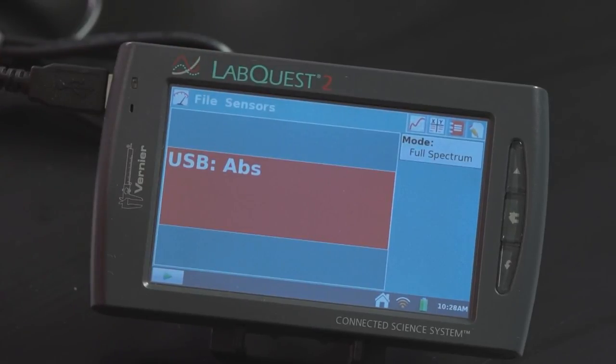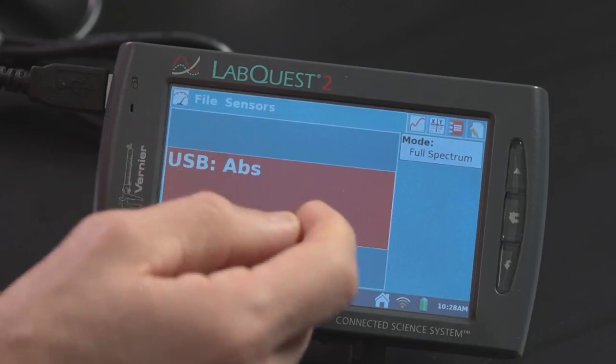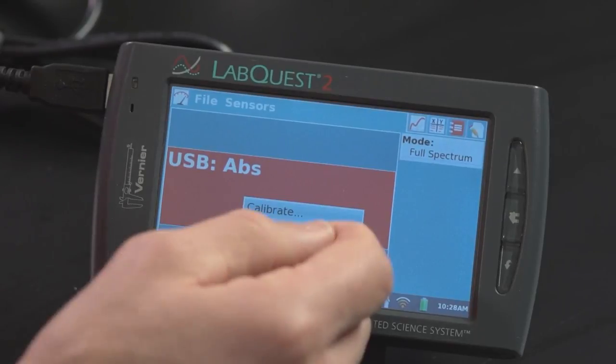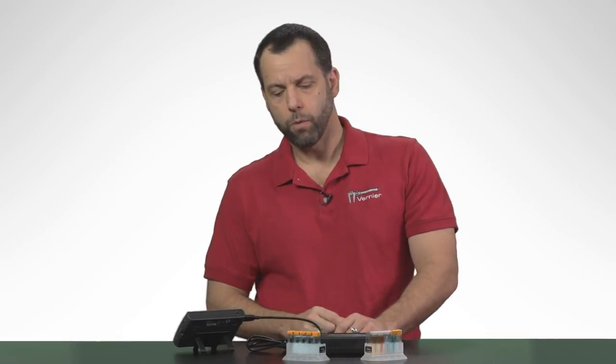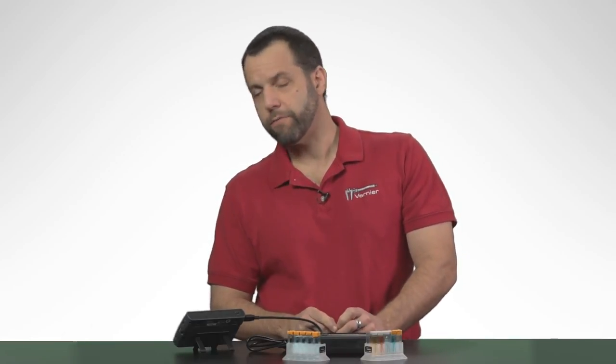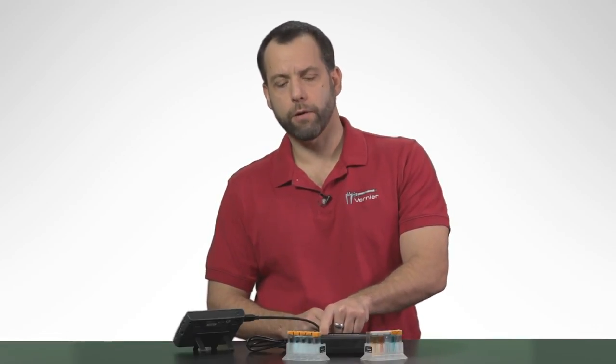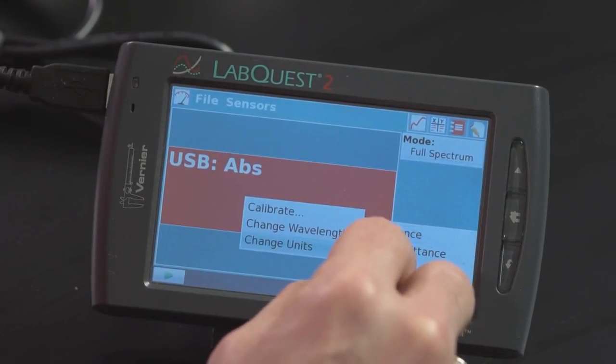I'm going to go back to the meter screen. I need to change how this instrument actually works, so I'm going to tap on the meter screen and change the units to fluorescence. There are two LEDs that can be used for fluorescence in the spectrometer: one is a purple LED at 405 nanometers, and another which is an aqua green LED at 500 nanometers. The 405 nanometer LED is designed for chlorophyll and for GFP, which is referred to as green fluorescent protein. So I'm going to select 405 and discard all of this data.